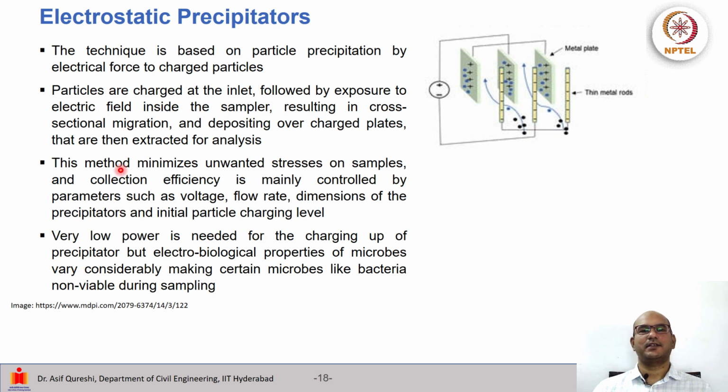This method minimizes unwanted stresses on samples, and the collection efficiency is mainly controlled by parameters such as voltage applied across these plates, the flow rates, the dimensions of the precipitators, and the particle charging levels.